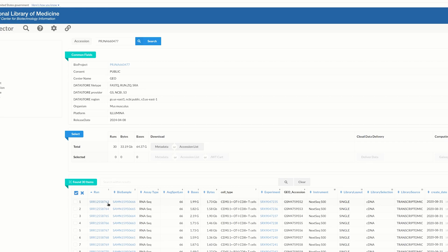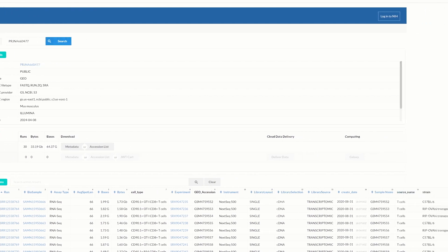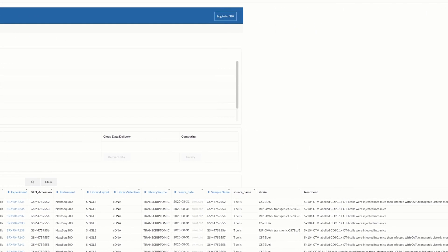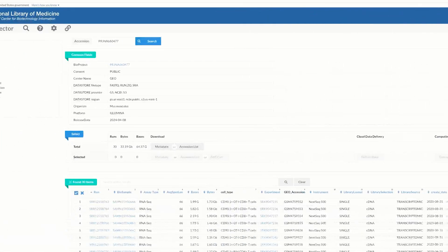In the SRA Run Selector you can get all the information about this study. Here you can see the SRA ID related to the raw RNA-seq data file, BioSample information, SA type and size, cell type, GEO accession ID, instrument used for the RNA-seq, library type — single-end or paired-end — and all other information. We will use this SRA ID in the SRA tool to download the FASTQ file.